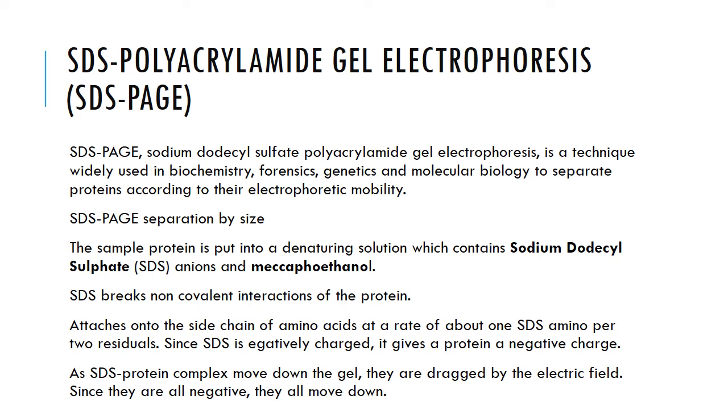The SDS, which is sodium dodecyl sulfate anions, and the mercaptoethanol. So how is this helpful? Remember, SDS is an ion, so it gives a charge to proteins.